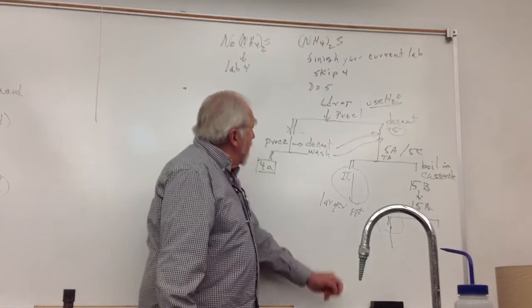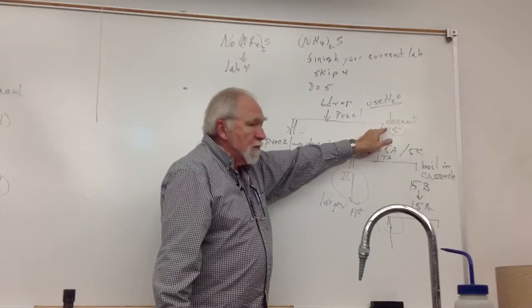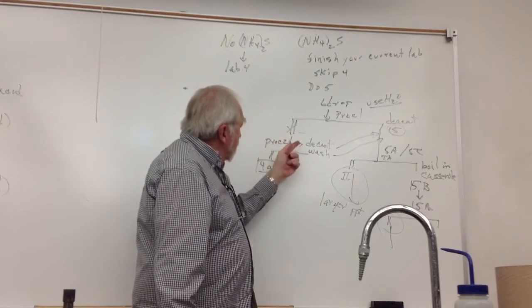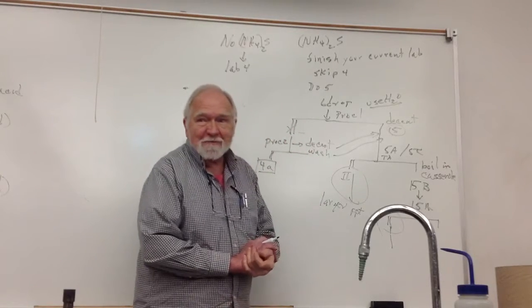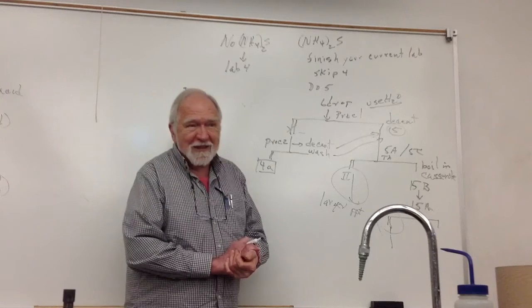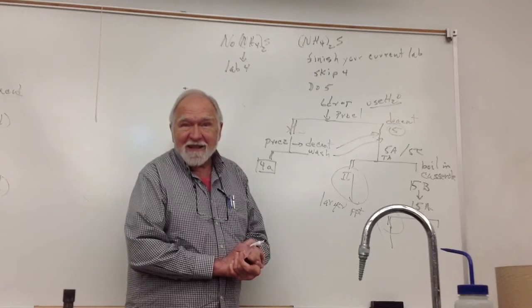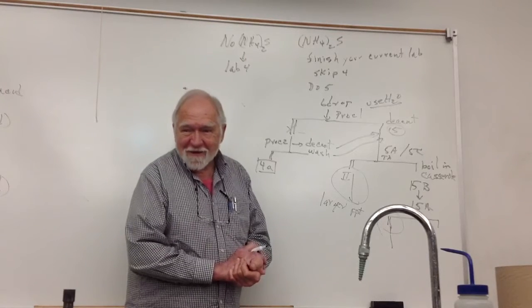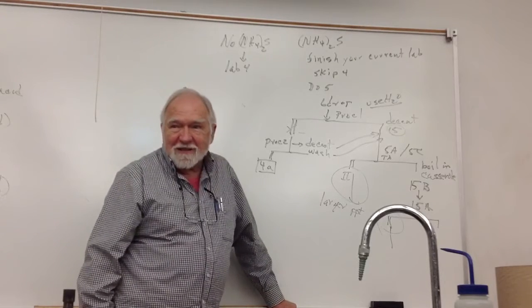The only important thing again, in procedure 1, you're adding all the extra water because you want the lead to be over here in the B group. When you're doing procedure 2, if there's any precipitate. If there's no precipitate, what do I always say when somebody says there's no precipitate? Several people have said it to me, and I've said it to you. If there's no precipitate, it's all decantate. Right? In the centrifuge, if there's no precipitate, it must be the decantate you're using for the next procedure where it says use the decantate.